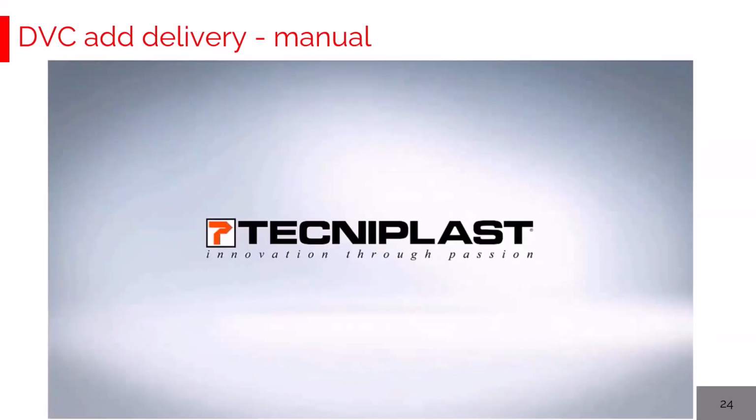So this is the way to add the delivery manually that is not covered by the scheduled task. Hopefully you appreciate that we are also approaching this important workflow, especially for big facilities handling breeding cages. So your feedback will be really needed to improve the situation and cover as many workflows as needed.